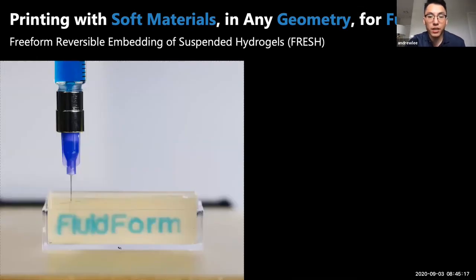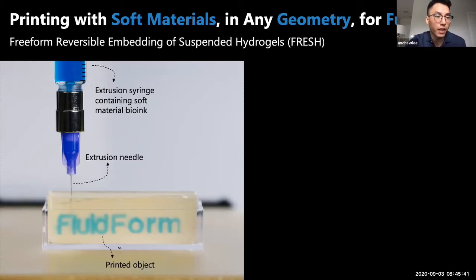Seen here is a type of 3D printing called embedded 3D printing. So we're not printing in air anymore, we're printing inside a support material. Seen in this picture, you have this syringe loaded with a blue soft material, bio ink or soft biomaterial. This is being pushed out of an extrusion needle, and this is your print. And then this yellowish material is the support material that is everywhere supporting your printed object.